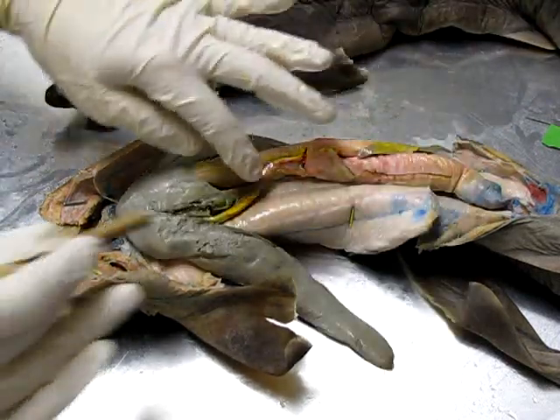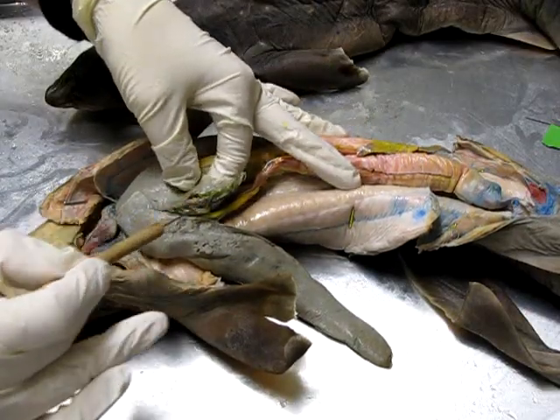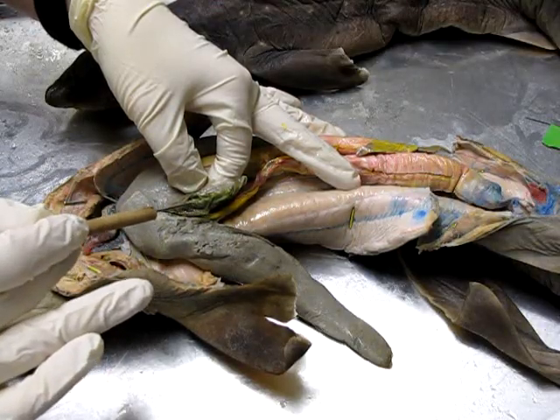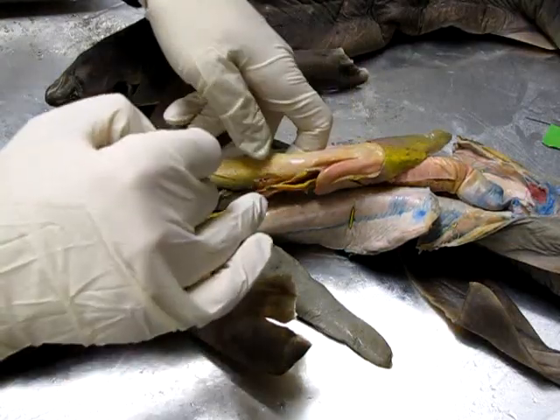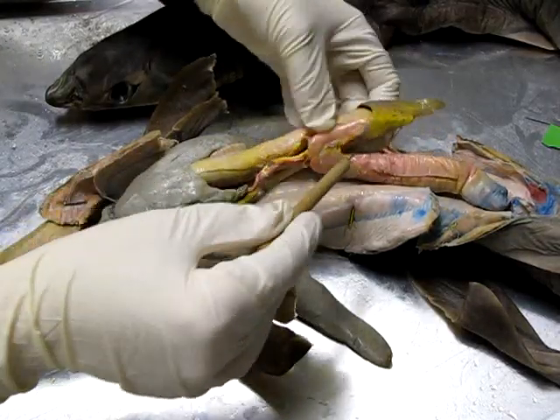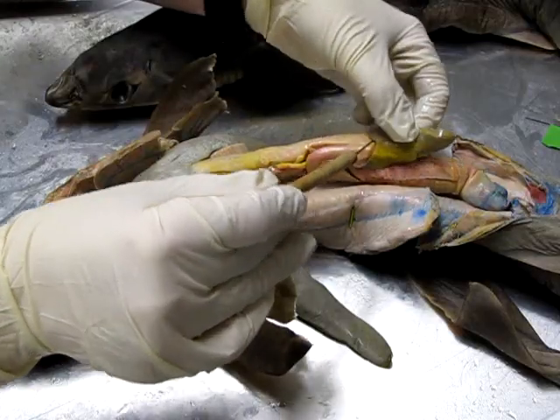Associated with the liver, as we usually find, is the gall bladder — this little greenish sack attached here on this lobe — which is the site of bile storage. Below the liver we can find the stomach, all of this right here.